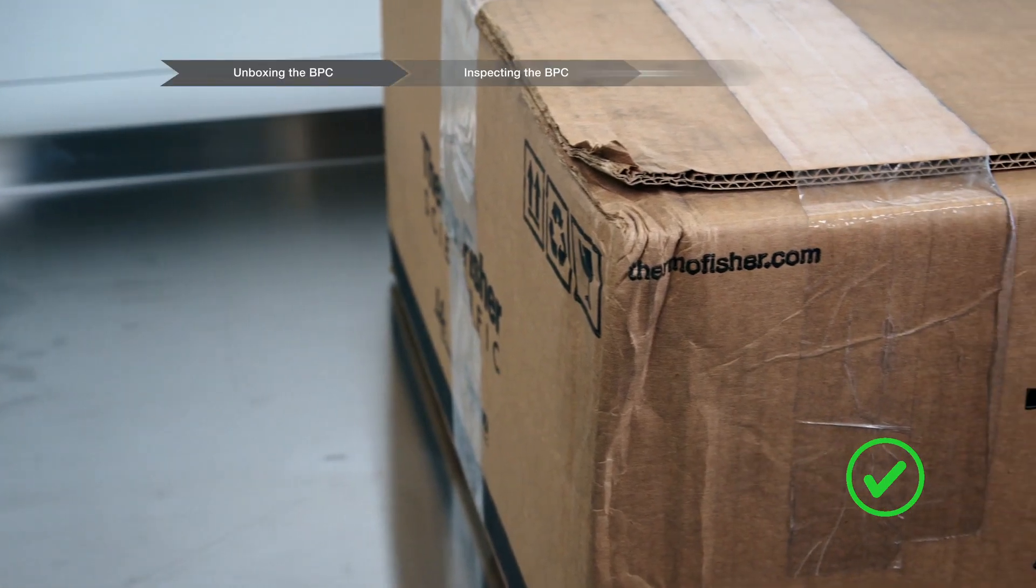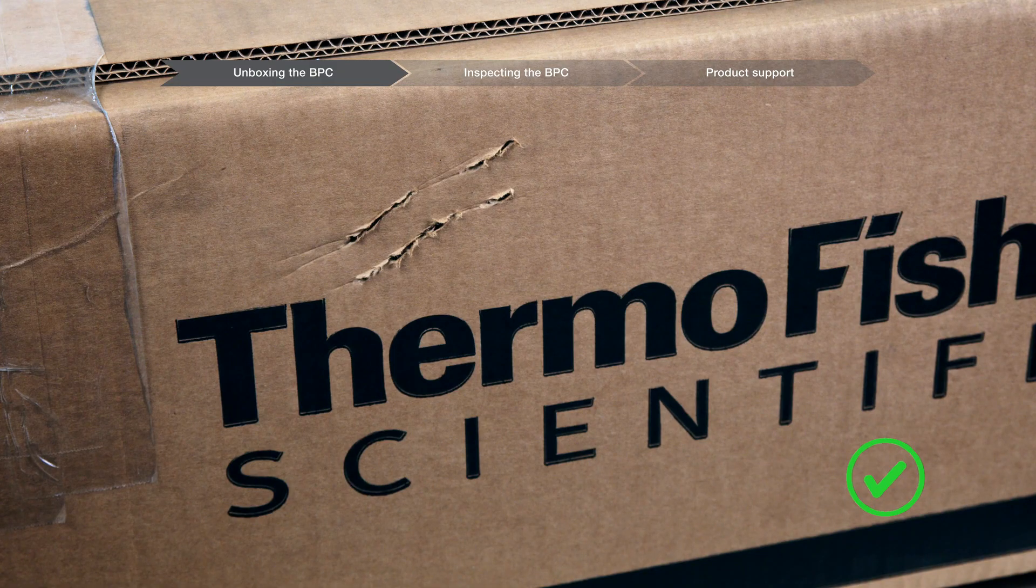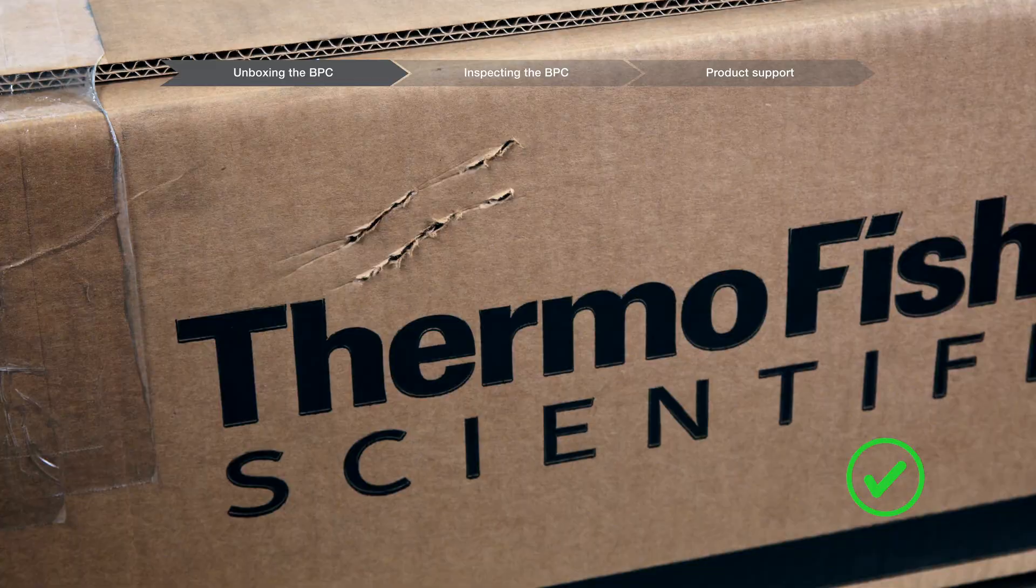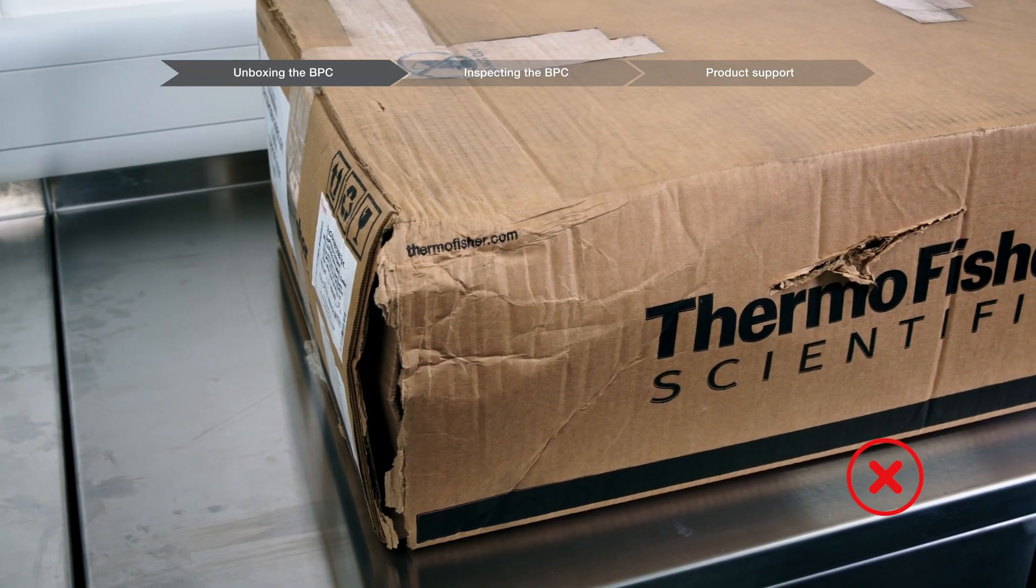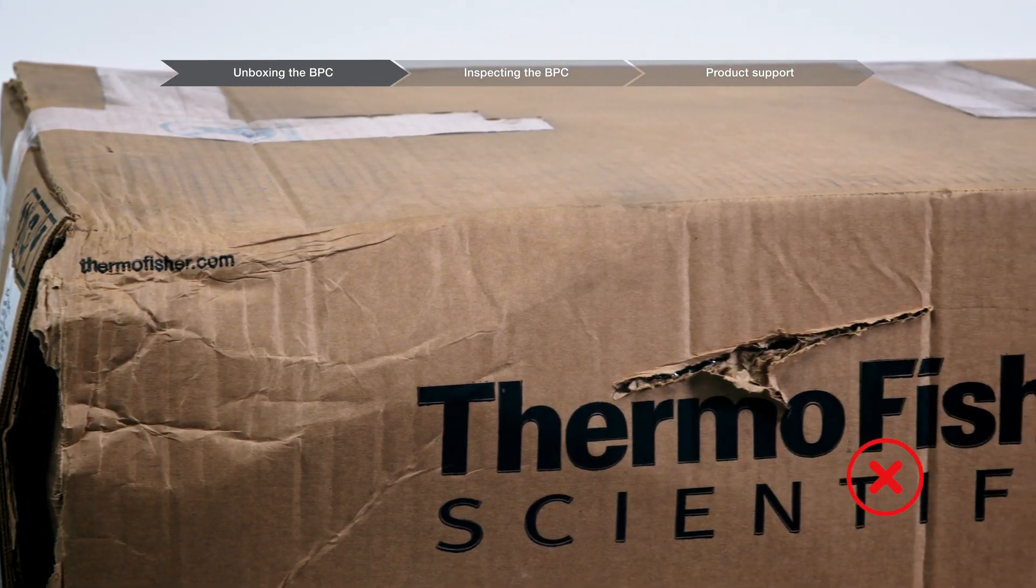The BPC is still usable if the shipping box arrives with a worn box corner or a minor perforation on the box. If your box arrives crushed or with a puncture mark through the box, do not unbox the BPC. Contact your sales representative.